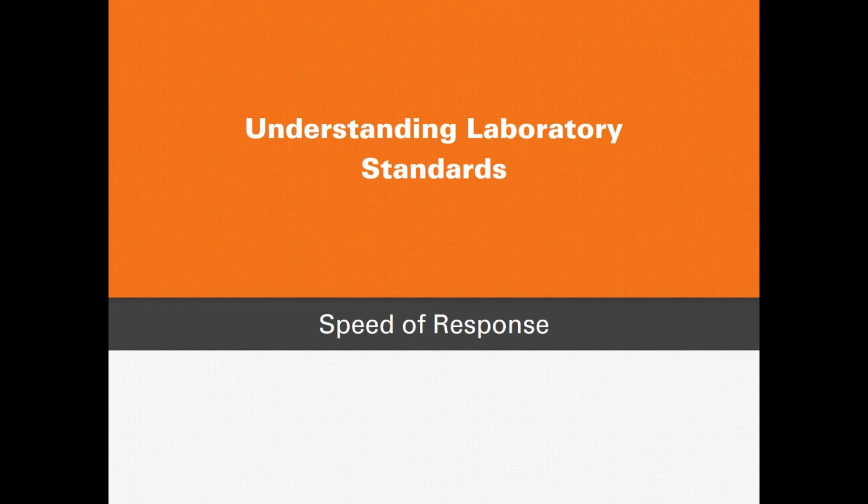Our next topic is speed of response. For speed of response here, we'll discuss how ANSI Z9.5 defines it and some recommendations that they have for the speed of response in the space.